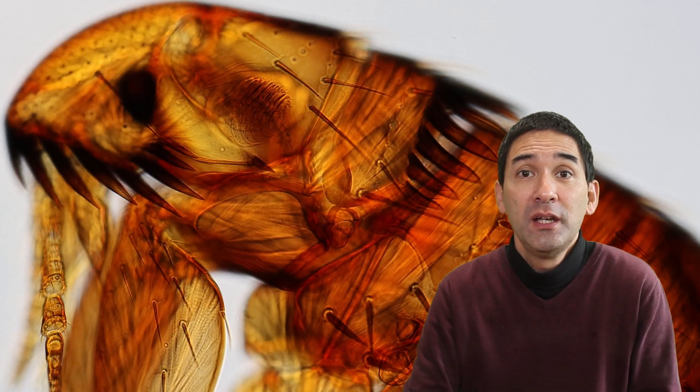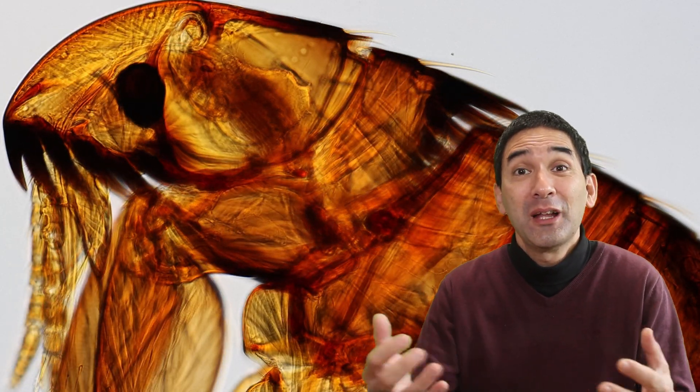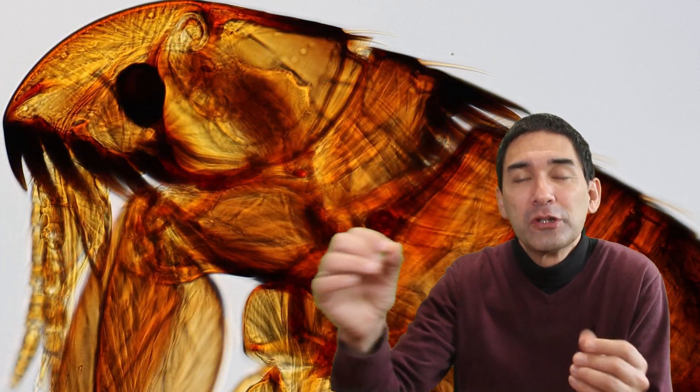For many years scientists did not know the mechanism that allows fleas to jump this far. There are actually several biological adaptations and under the microscope we are able to see some of these adaptations. That's actually one of the things I'd like to show you in this video. How are the fleas adapted to jump those large distances?